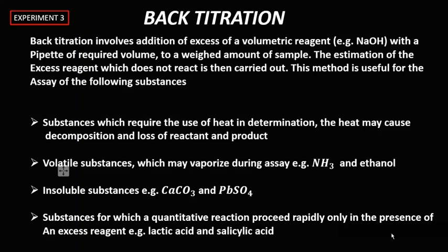All right, so the next titration experiment we are going to look at is back titration. Now, I'm just going to run over the general overview of back titration. Now, what is back titration? According to what we have on the screen here, I'm just going to read through it and then I'm going to explain it.